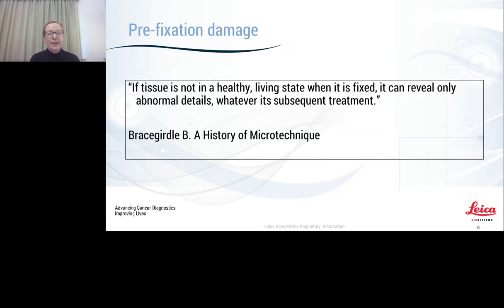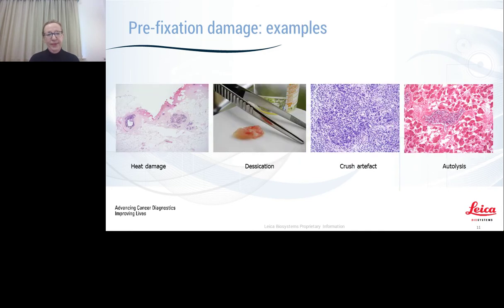So first of all, here's a quote from Bracegirdle, and this was sometime in the last century, but nothing has really changed in this aspect. If tissue is not in a healthy living state when it is fixed, it can only reveal abnormal details, whatever its subsequent treatment.